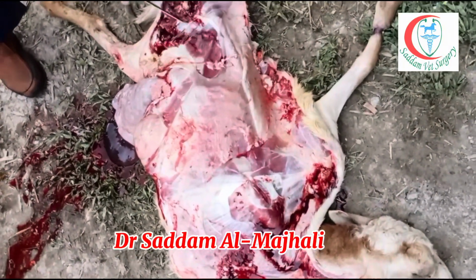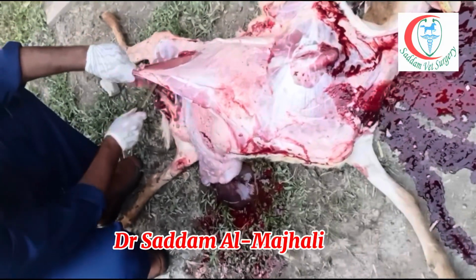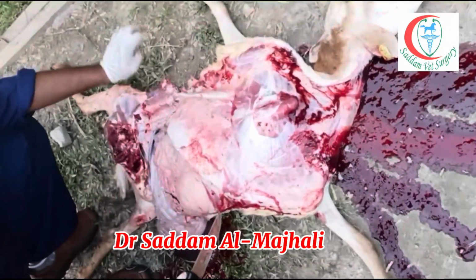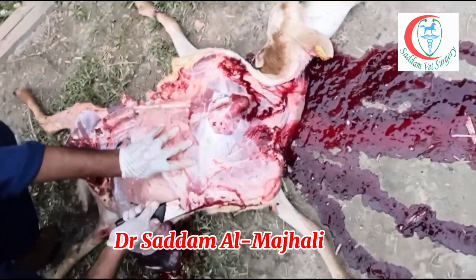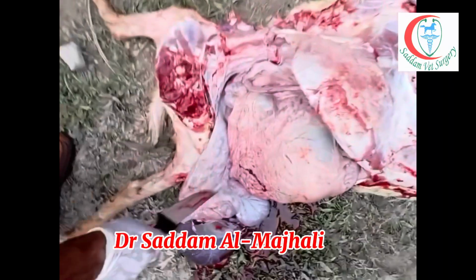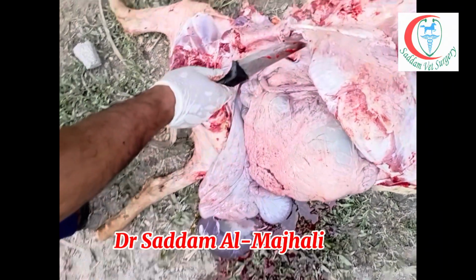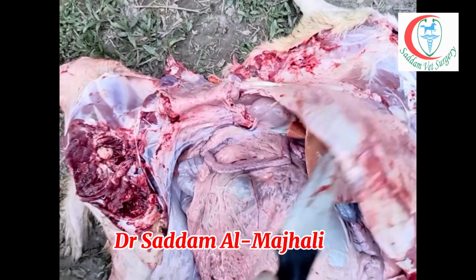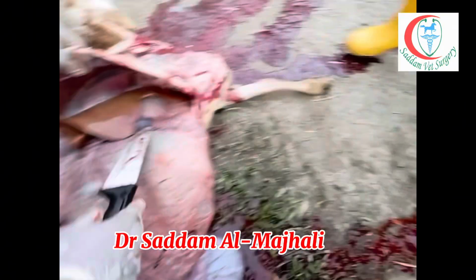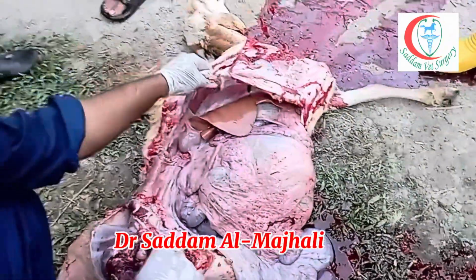Okay, so now I have this look. First thing I see this look. Also I see if it has a uterus, I can see the baby here. This is the kidney, this is the right kidney. I see the liver also. All this is inside the abdomen cavity. See, the liver is not normal.